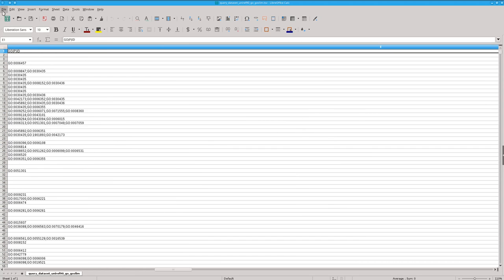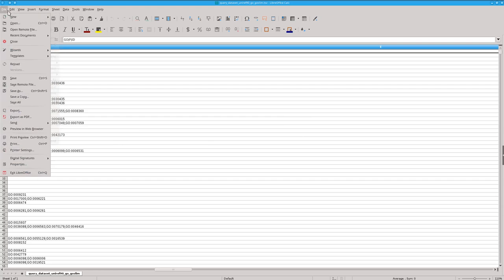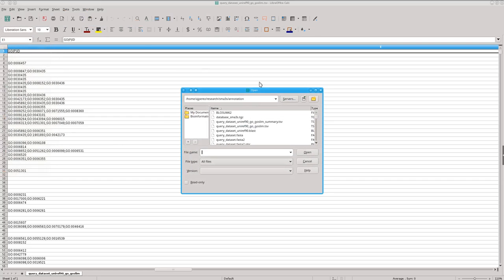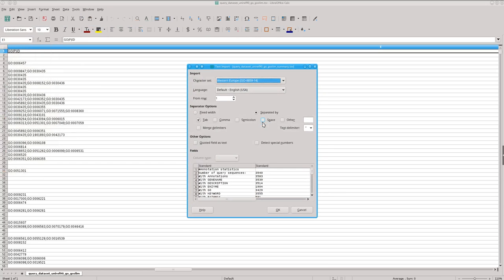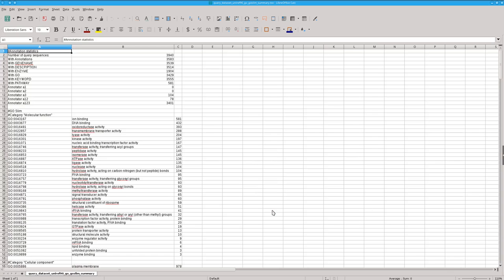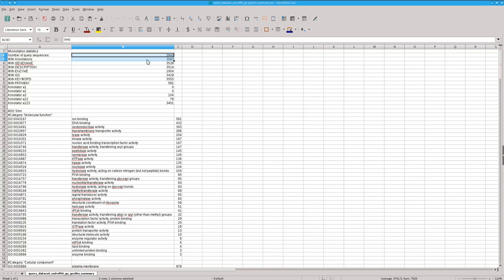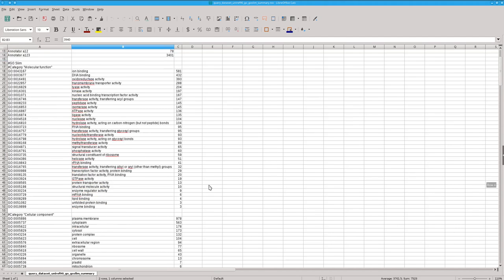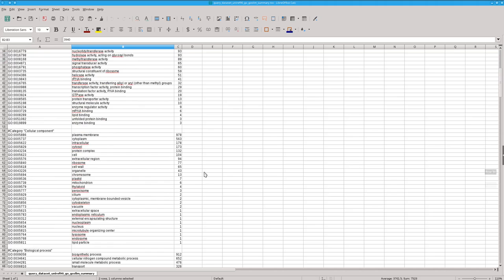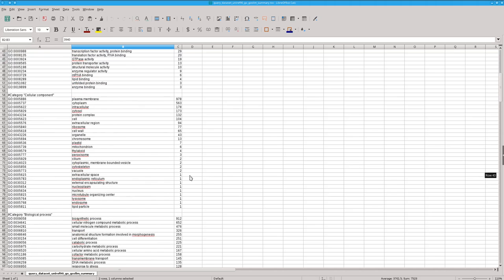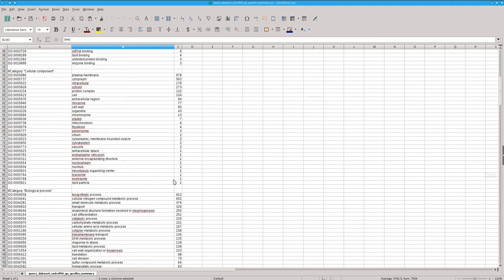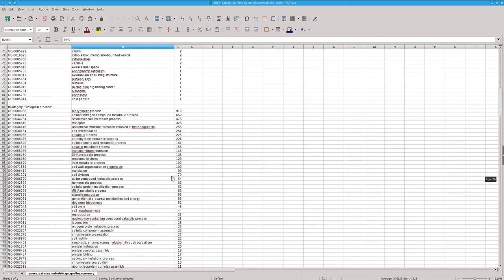The other file, the summary file, has a summary of the result with the number of annotated sequences in global or by annotation source. Below, you have the number of sequences belonging to different functional categories, for example, biological processes.